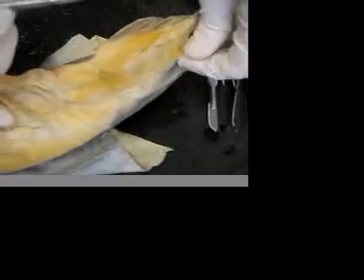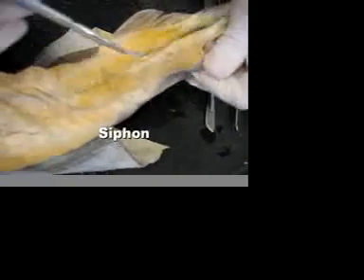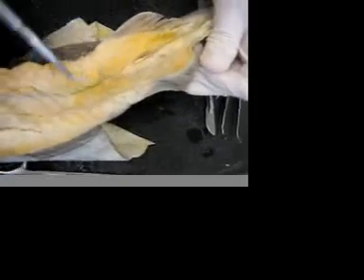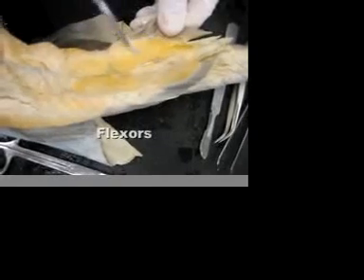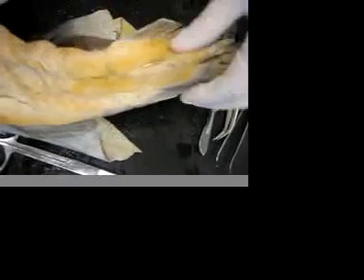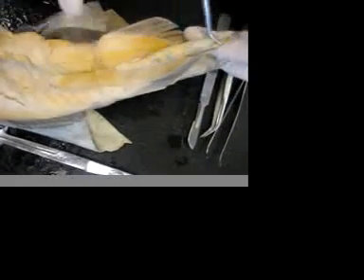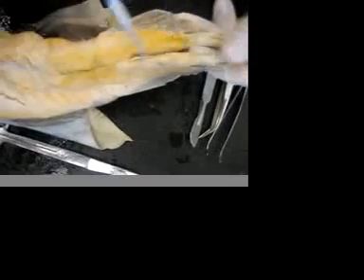Looking at the pelvic region, on this side we have taken off the siphon — this is the siphon. You can see the flexor muscles right there, and in between here is the cloaca. We have a male, so this is a clasper. On a female they wouldn't have claspers, but that's what they use to reproduce.